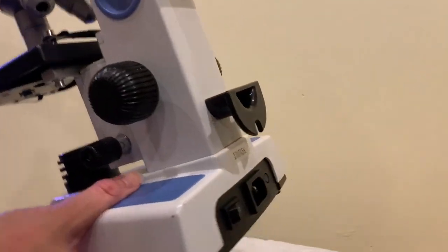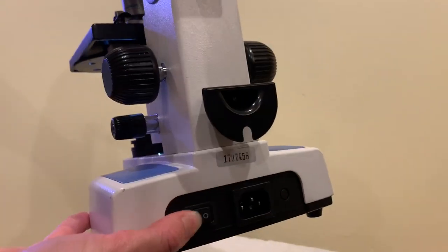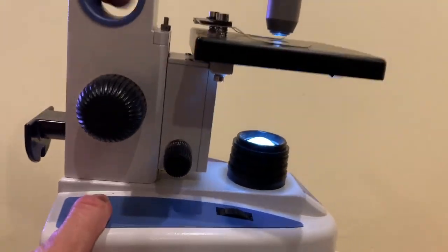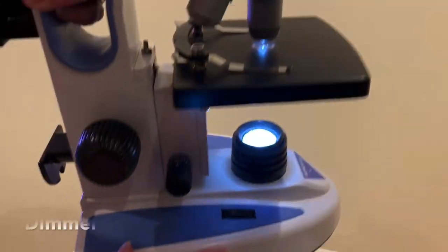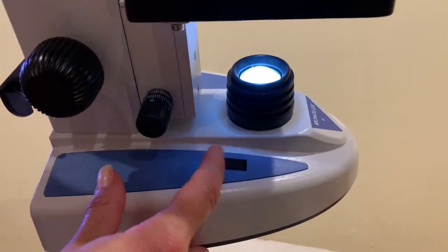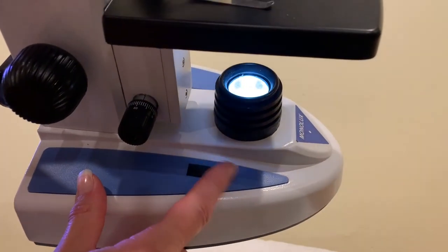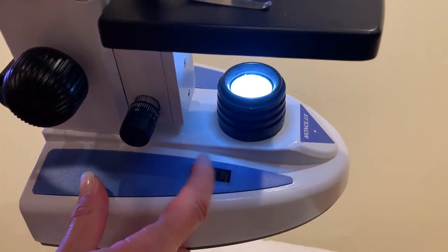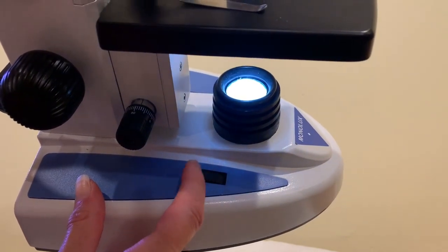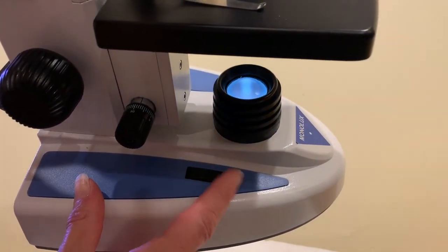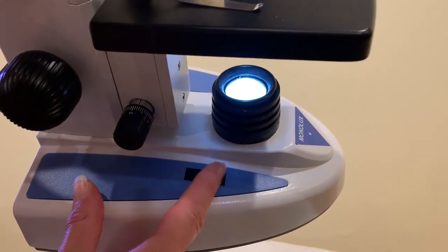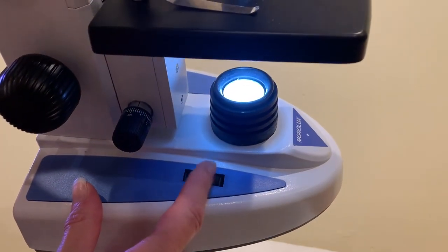And one last thing. When you turn on your microscope here and the light turns on, there is this knob right here and when you turn this knob, if you look, it increases the brightness and decreases the brightness of the light. So this helps with contrast.